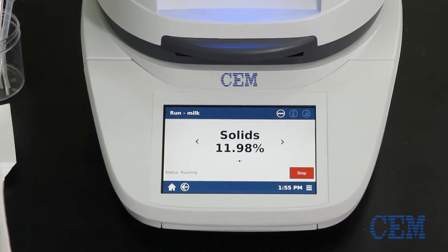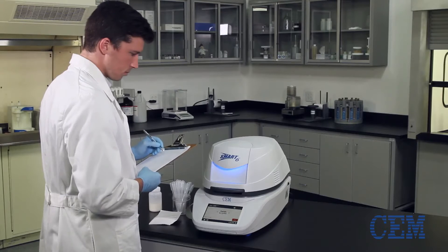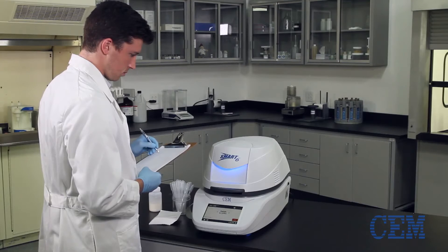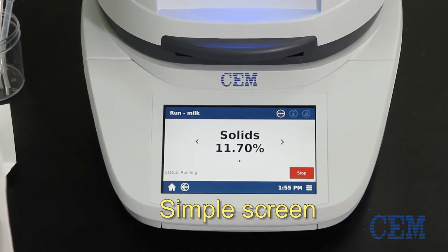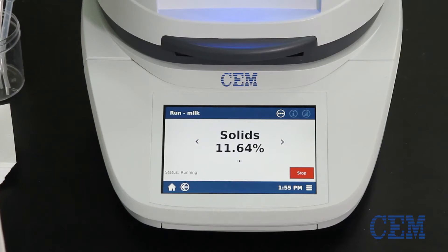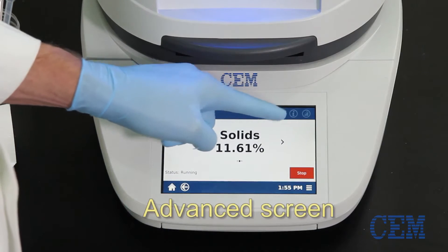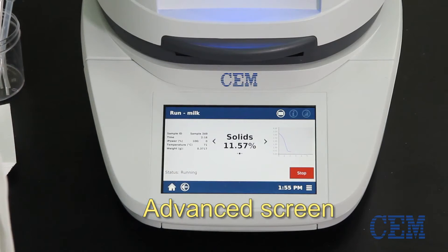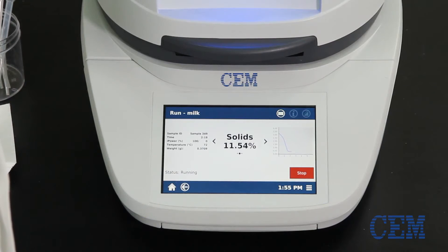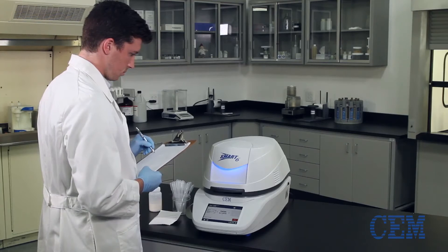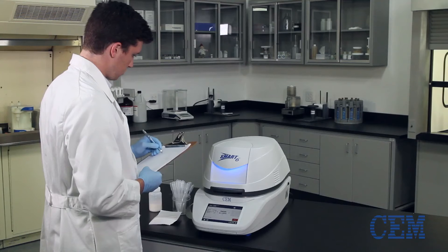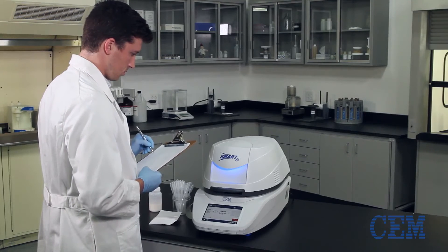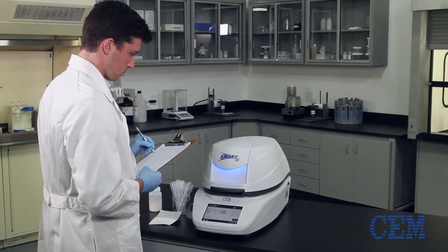During analysis, you can choose between two different unique screens for viewing test results. If you're using the Smart 6 for process control analysis, the simple screen provides a clean view of the current moisture or solid status during the drying process. Use the Advanced screen if you're analyzing samples for research and developmental purposes and are interested in temperature and power parameters. Using this screen, you can also view a graph of real-time weight loss and temperature. Both screens display the same results, but they give you the option of viewing the information in a way that's most convenient for you.